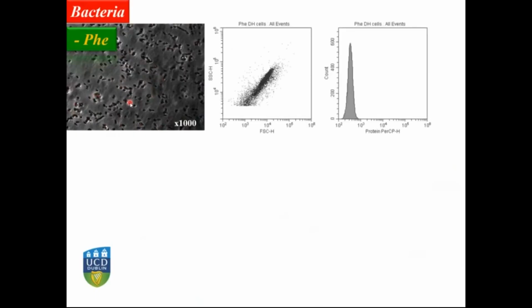And in this case, we have this group of bacteria. We can see that we have some red spots. Those red spots are proteins that crystallize and produce that red fluorescence. So in this case, we can see our population of interest for side scatter. These are my cells, how they look like, and the expression of this protein in the red fluorescence.